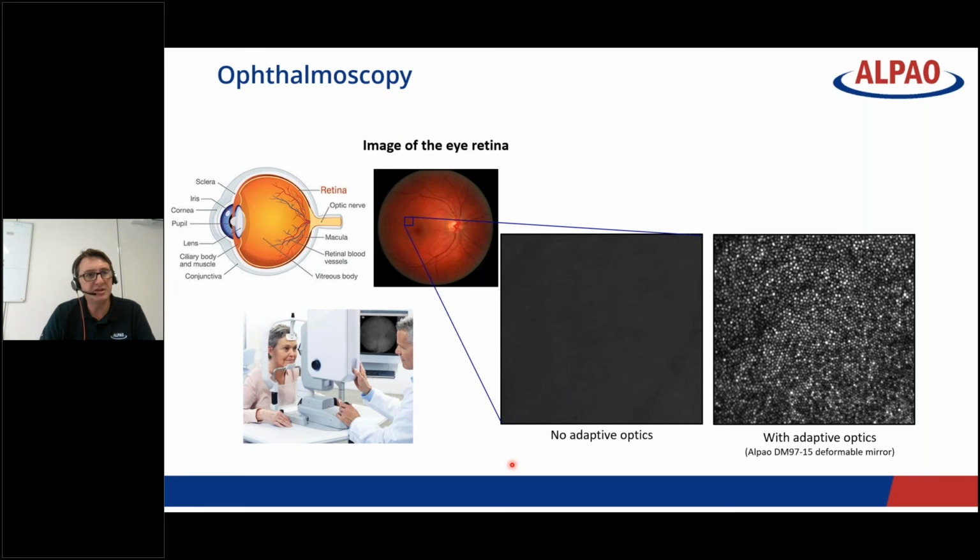And this image is also a good way to answer one question that we commonly have about adaptive optics. The question is, why don't you just use a computer algorithm to recover the sharpness of the image? Using AI or other computer software, now you can do fantastic things. And the answer to this question is on this slide, actually.